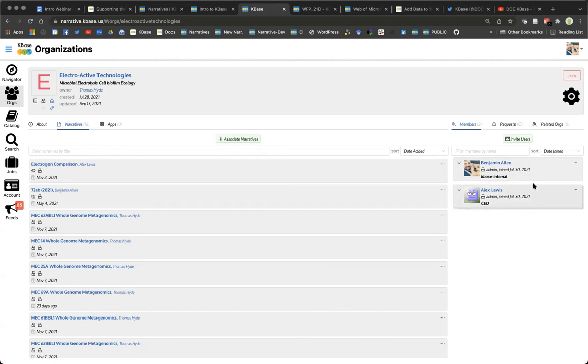So you can see I've got the list of people here that are users. I can invite other users, and I can see all of the work that we've done and access it from there.